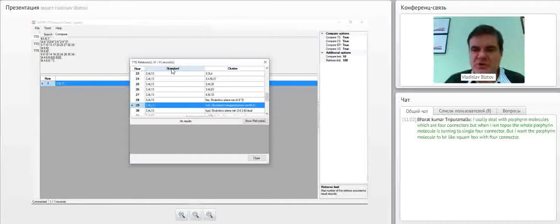So probably if in my structure there are some clusters, some dimers, for example, we can get a much simpler topology, honeycomb topology, and very common topology for the crystal structure, if we consider these dimers, these clusters in general, as new nodes of the network.